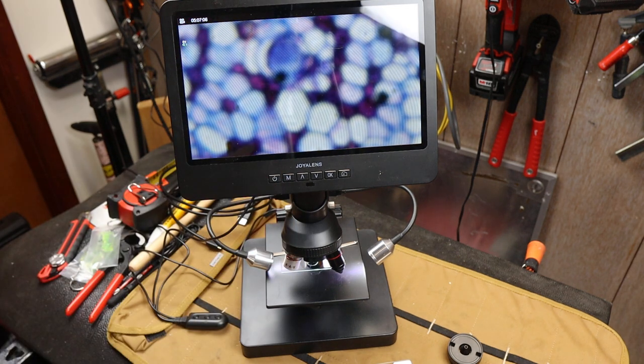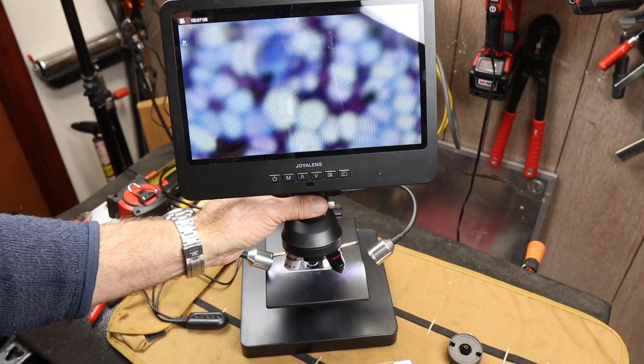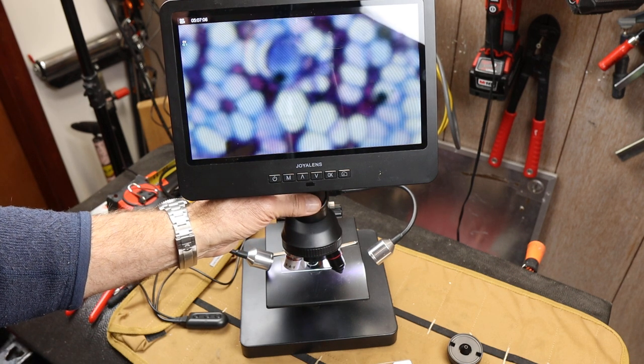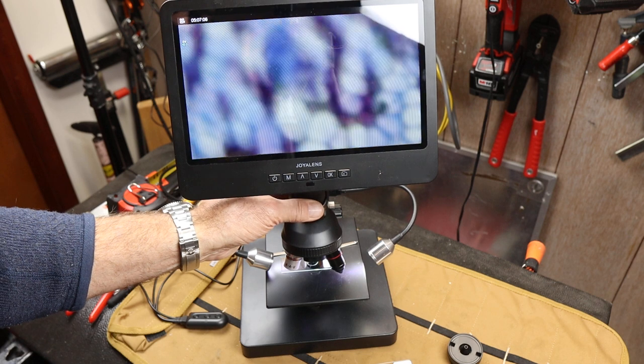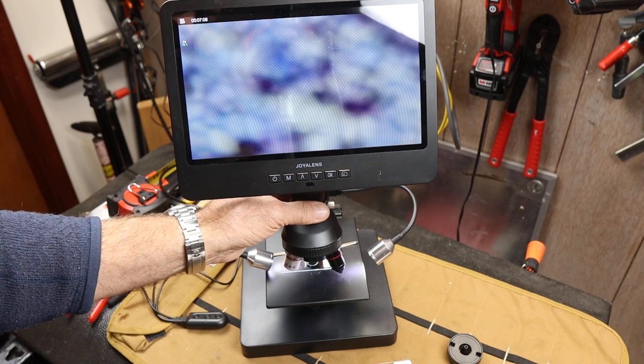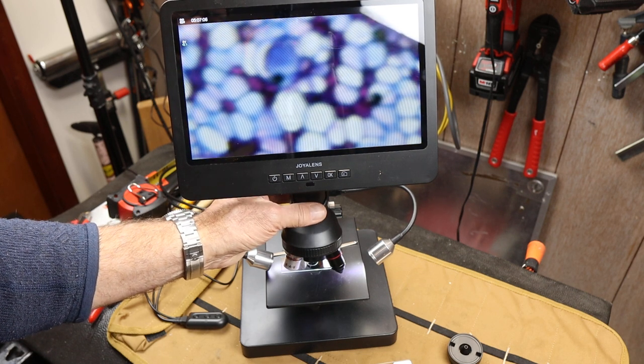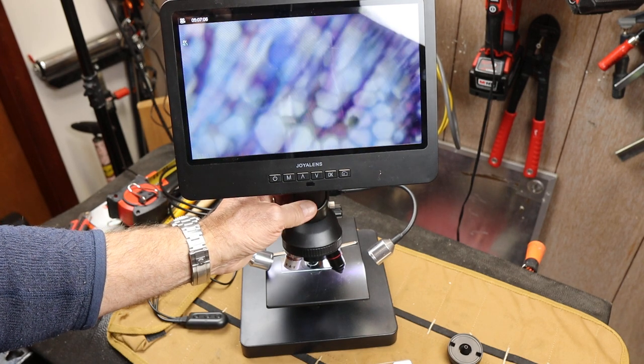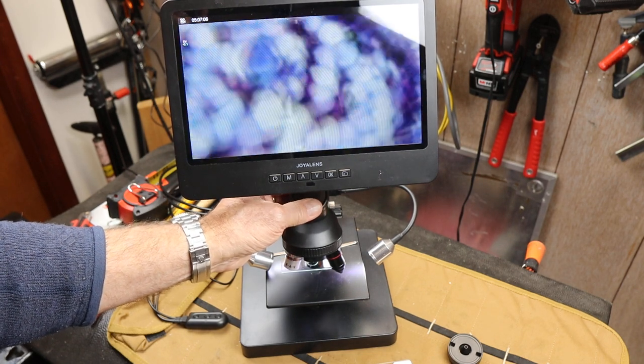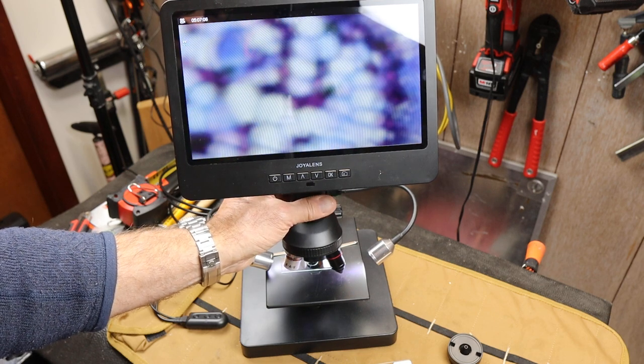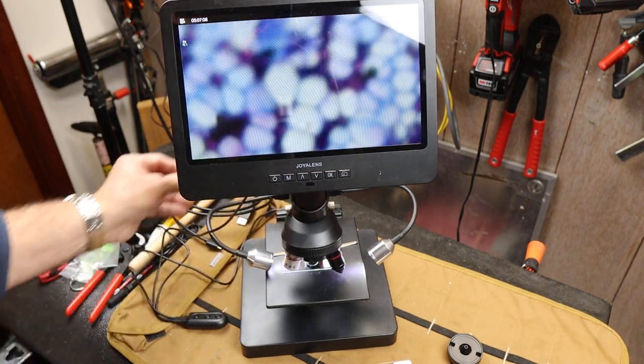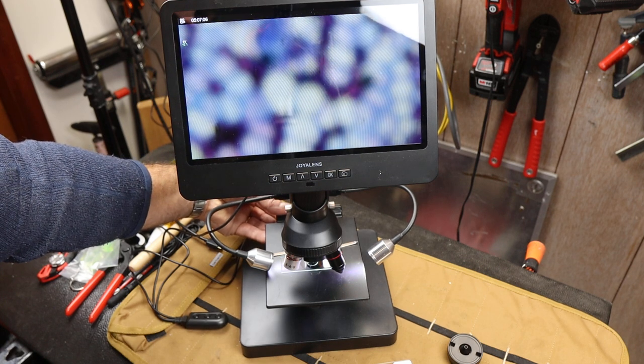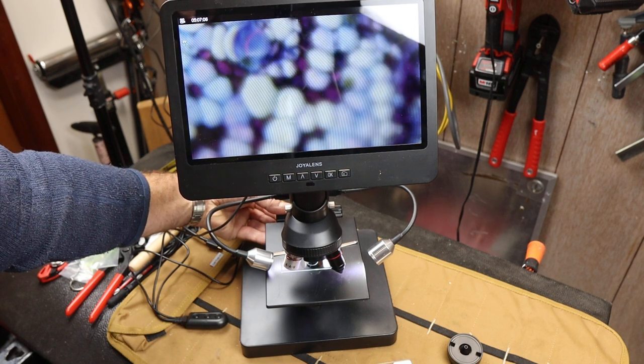That's again, that artifact of the, bring it in, coming in for a landing. There we go. That's an artifact of the plasticness of this, which can get frustrating, but it also keeps the price down.